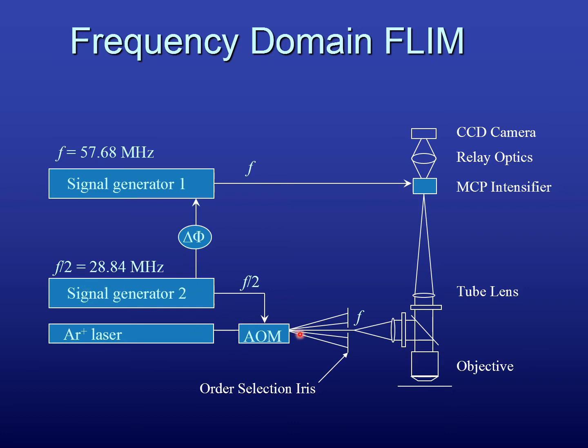When you're at the zero line, then you get a maximum zero order through. When you are at the positive or negative amplitude of this thing, then it's deflecting the light up to almost 100%. And this way, basically you double the frequency again.